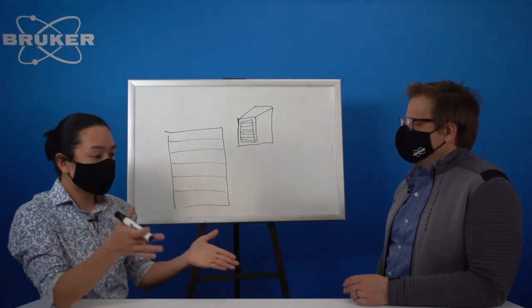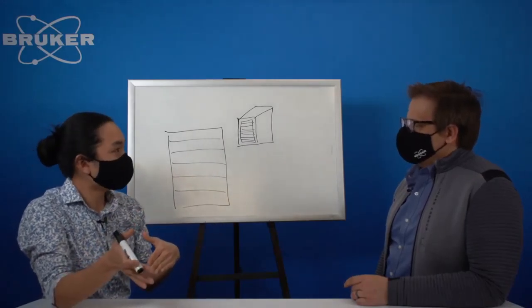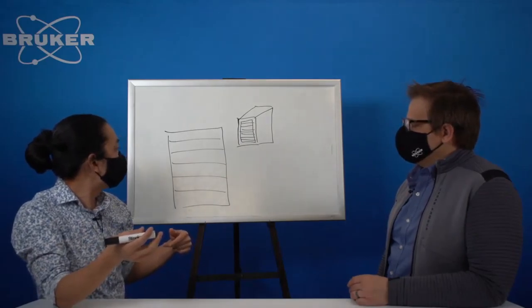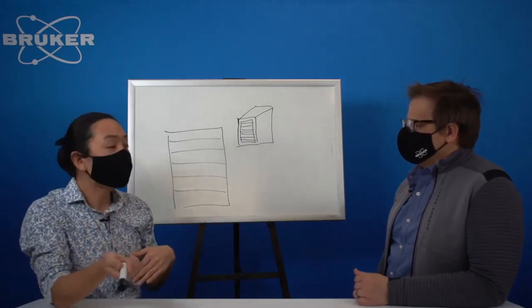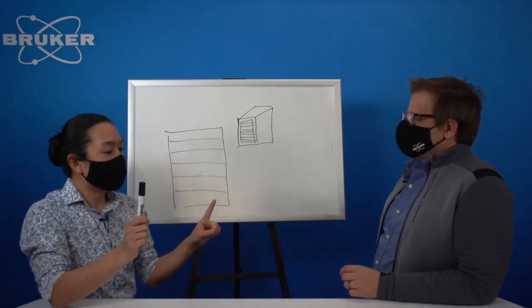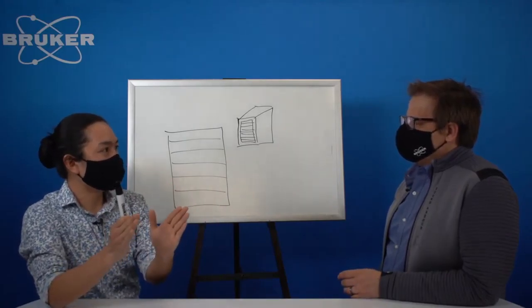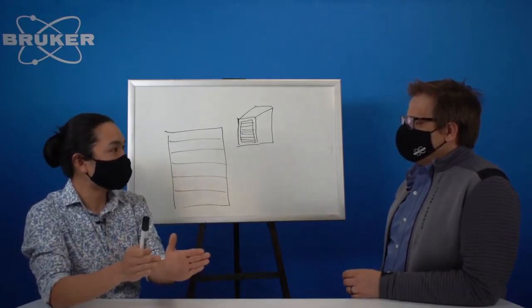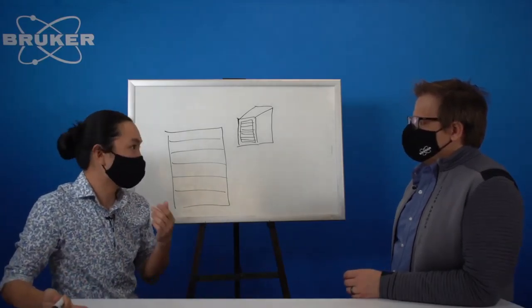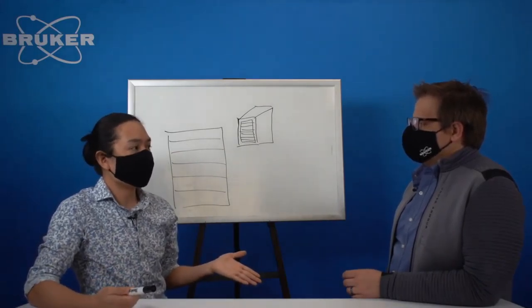So an X-ray of a specific wavelength hits this, and you get an electron-hole pair of a specific distance. For things like energy discrimination, what you're able to do is read things out and say, I want to have this specific energy of events happening, because I can correlate this to a specific energy of wavelengths. That is exactly what we want in a diffraction experiment, because we know the wavelength that's coming off of our tube.